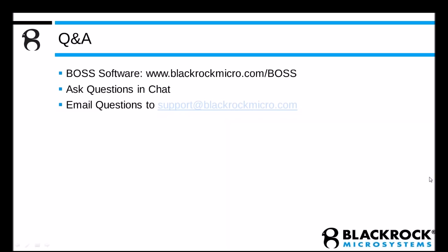They asked whether they could combine and sort all of these together. So it's like batch processing, but instead of doing them sequentially, it's all at once. Similar to the batch processing feature, BOSS doesn't currently have this, but it is also planned for version 1.2, which releases in a couple months.